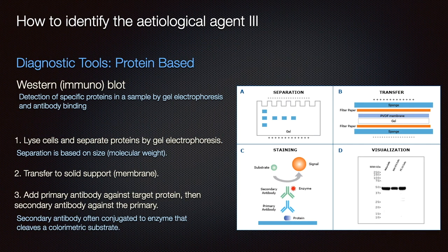Okay, moving on to the last diagnostic tool that we're going to talk about today. This diagnostic tool is protein-based. It's called the Western or Immunoblot. This is a very common laboratory method. Unfortunately, it doesn't scale well, and it takes significant time and expertise.